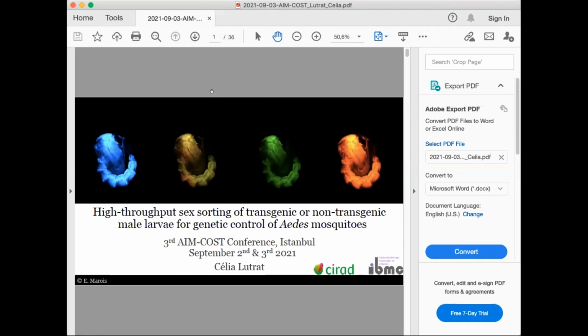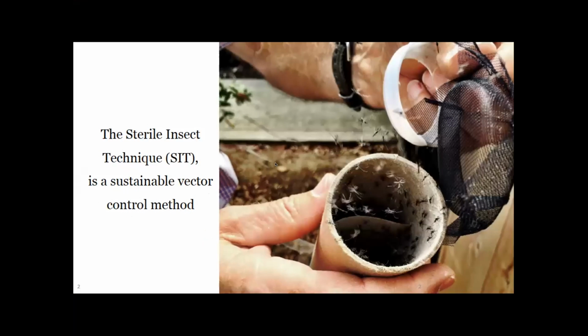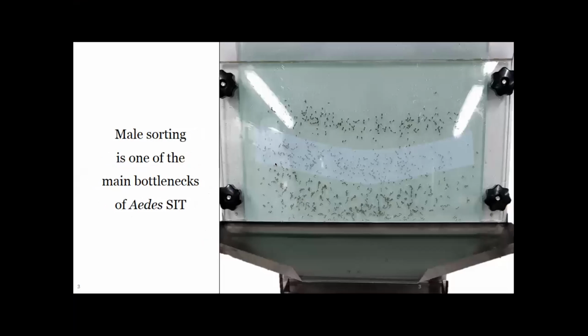So I'm Célia, and I'm gonna talk about the high-throughput sex sorting of transgenic or non-transgenic male larvae for genetic control of Aedes mosquitoes. So this comes in the frame of the sterile insect technique and genetic control methods in general that rely on the releases of large amounts of sterile males.